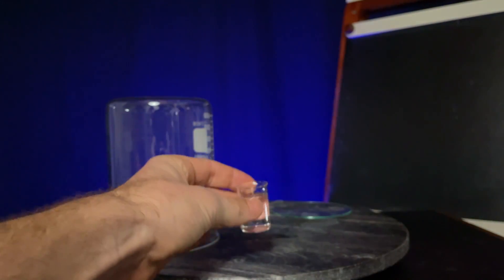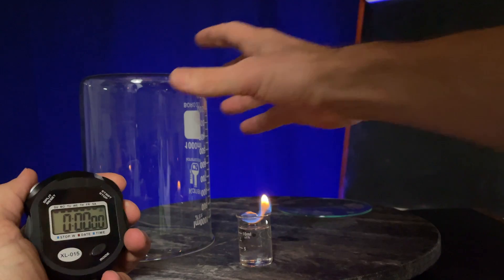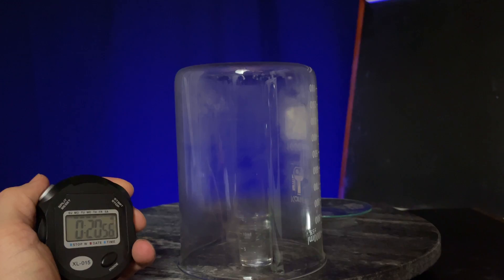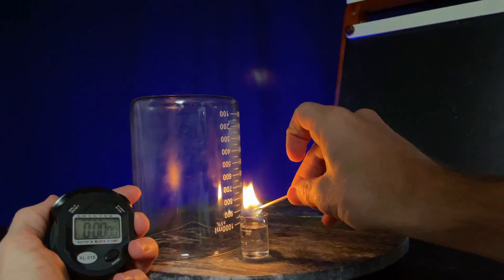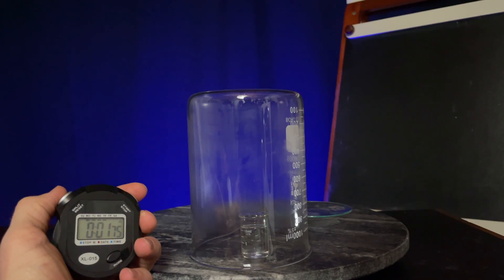Now I'll light this tiny beaker and I'm going to attempt to cover it while starting my stopwatch. Let's see how long it takes to go out. 20 seconds. Now if I relight the beaker and cover it again, do you think it will burn longer or shorter? Less than two seconds. What could account for the flame going out so fast?